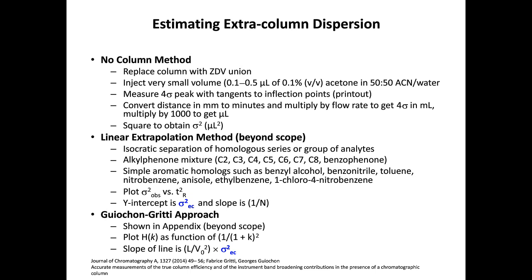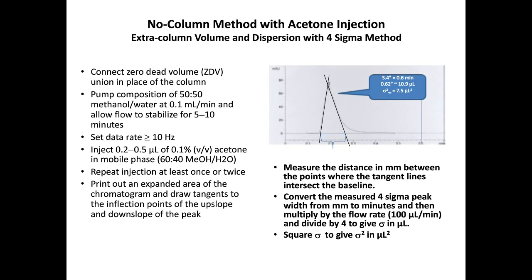Here's an example of what I just talked about, where you draw the tangents to the peak and so on. You can look at this after the fact, but I basically discussed this verbally.